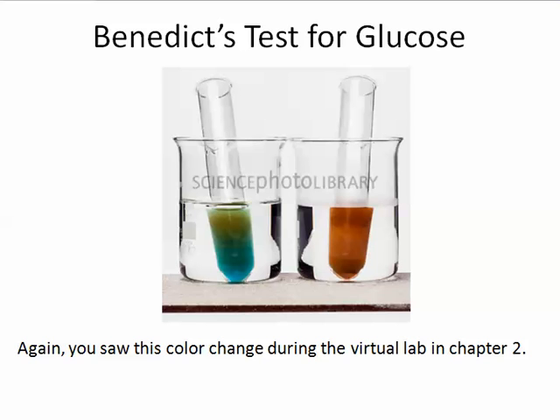You're going to need to wear safety glasses. You're going to need to pay particular attention because the hot plate is on. There's a hot water bath that is sitting on it that we need to use for that Benedict's test. Please make sure when you're finished with the lab that you clean your area up so that it looks the same as it did when you arrived.